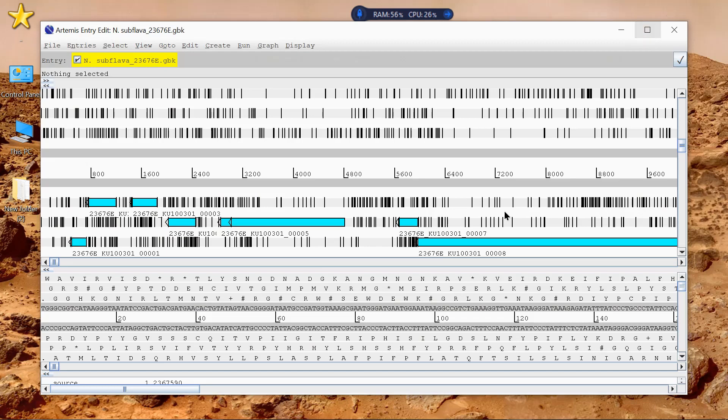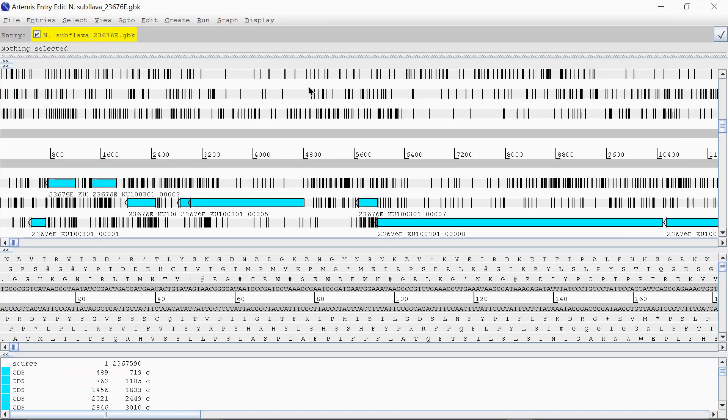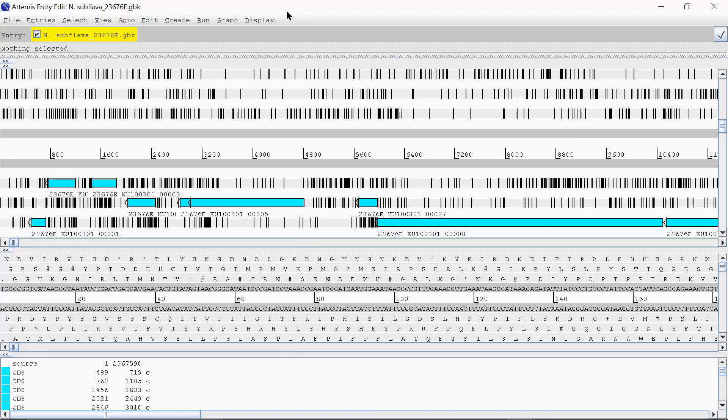And what you get is a window that looks like this. I had this in the presentation a little bit earlier. So you've got your six-frame translation tracks. Three on the forward, three on the reverse.